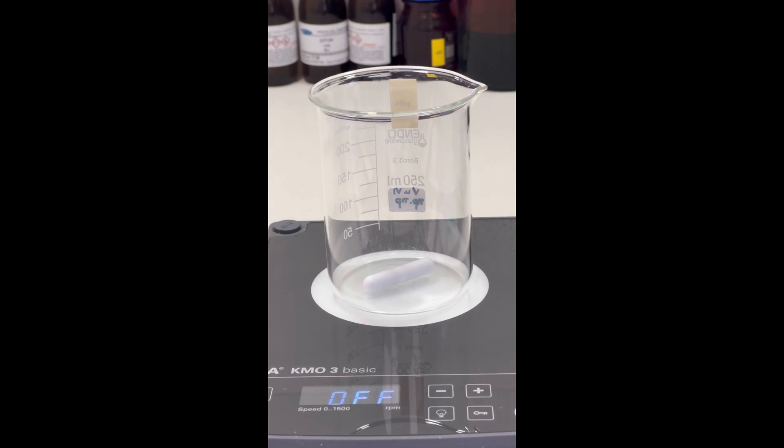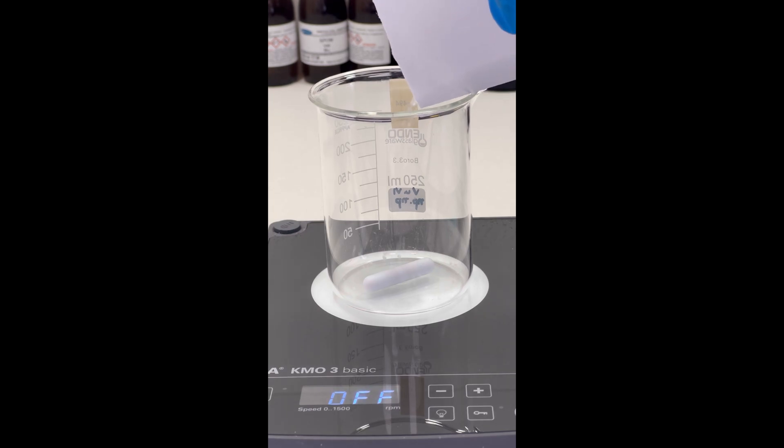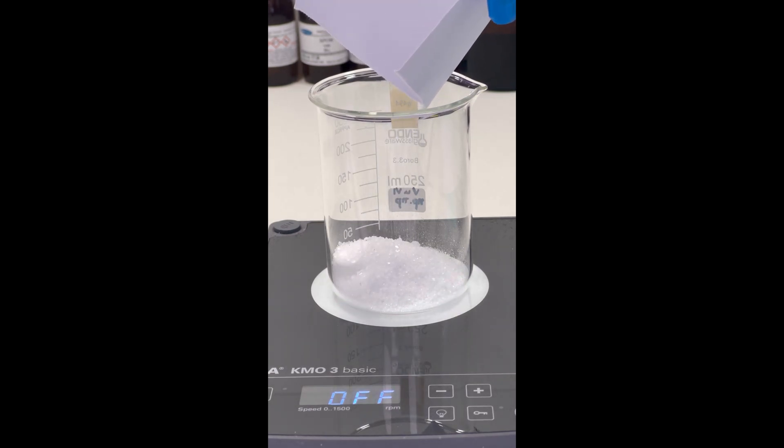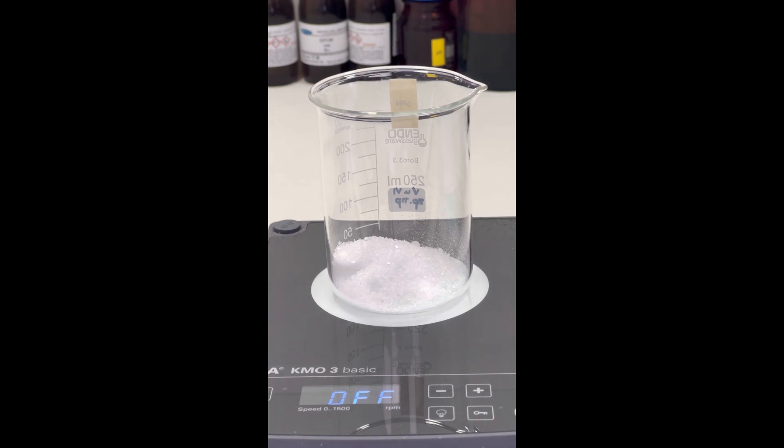To synthesize ferric ammonium citrate, we begin by preparing an ammonium citrate solution. First, we add 20 grams of citric acid to a beaker and pour 50 milliliters of distilled water over it.